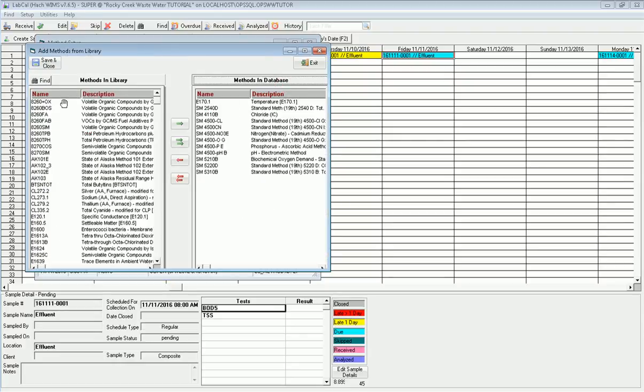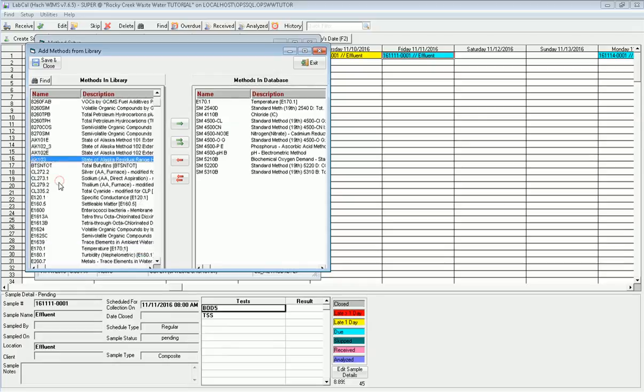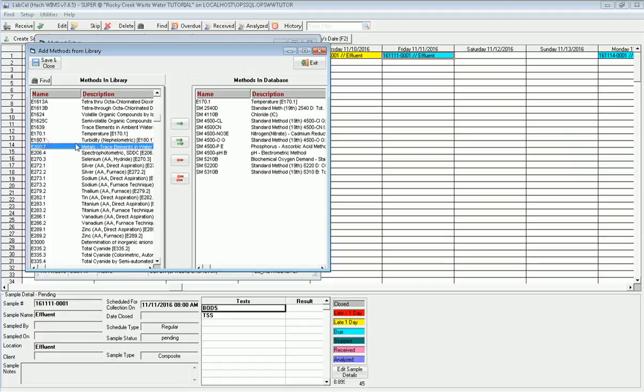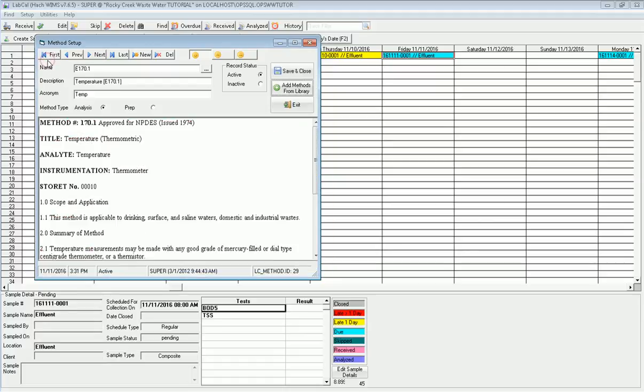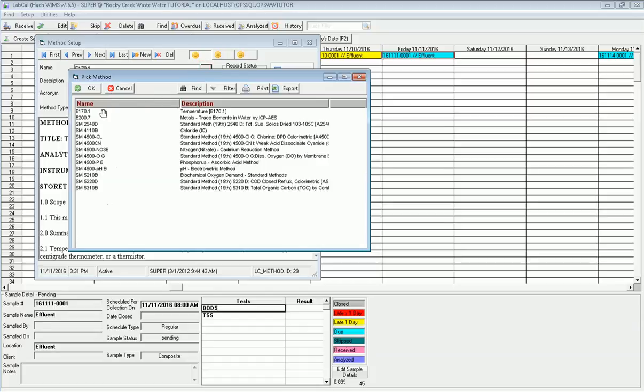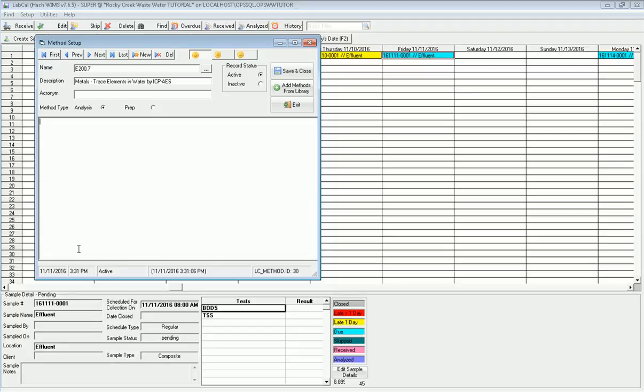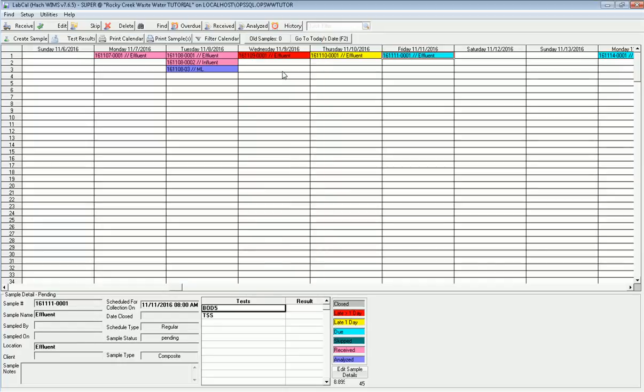Setting it up, I've got a list of all the methods that are available to me, and on the right, the methods that are already in the database. I'm just going to scroll down to EPA 200.7 right here, metals, and I'm going to bring it over and save and close. Now I could add more of these methods right here, but at this time that's all I need to do. Now if I go to browse, I've got the 200.7 method and it's entered in. This is an analysis method and I can type in my standard operating procedure for that method. In this case, we're not going to do that, just for time consideration. I go ahead and save my method.